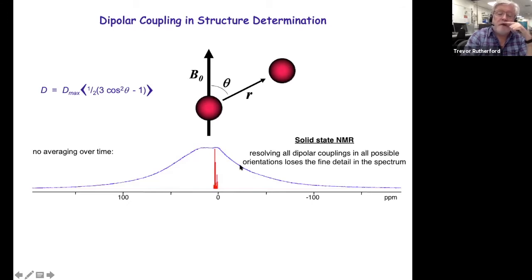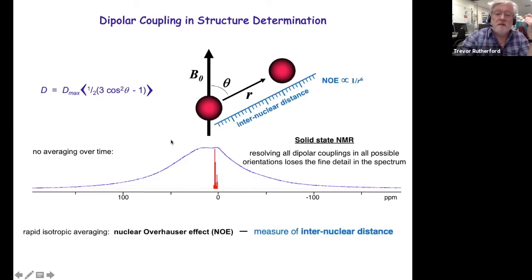So solid state NMR becomes a problem of trying to remove those dipolar couplings. It's a very different technique to solution state NMR, and it's not one that we do in-house in LMB. We would have to collaborate with specialists in solid state NMR outside if we were looking at solid state samples. For everything that we do in-house, we stick to solution state. We should say, though, that the dipolar coupling term doesn't disappear. It just averages away. The splitting averages away to 0.